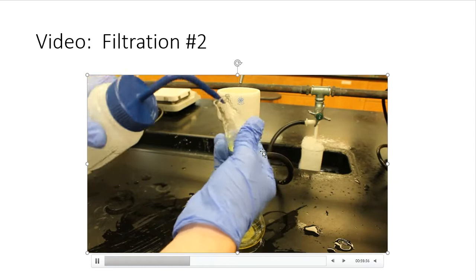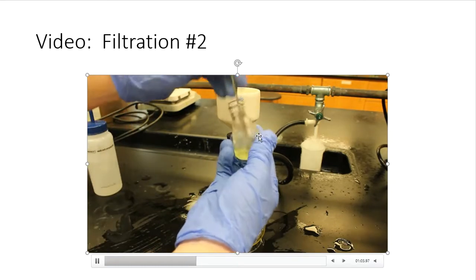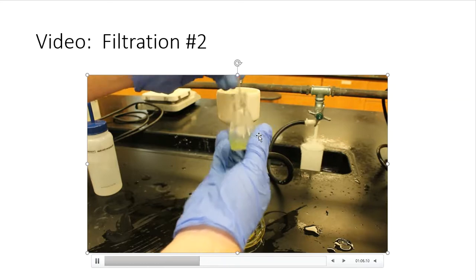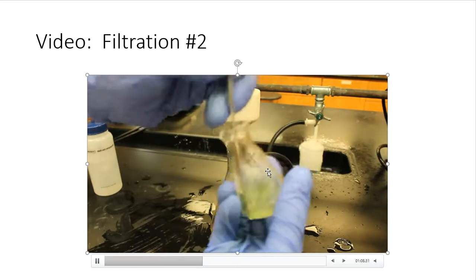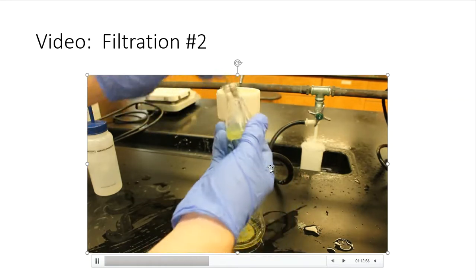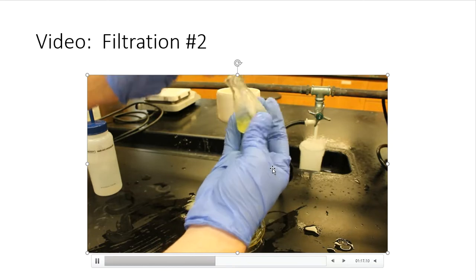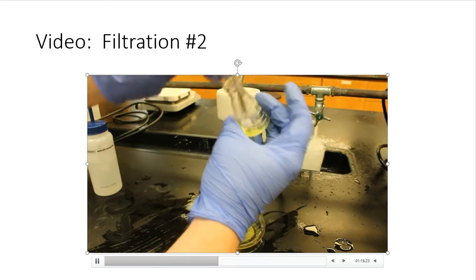So as you can already tell, these rinse steps are more efficient in getting rid of those crystals out of that flask. So I'm going to work with this just for a little bit, and then we'll move on and take a look at the final observation of the crystal and of the filtrate from the filtration step.